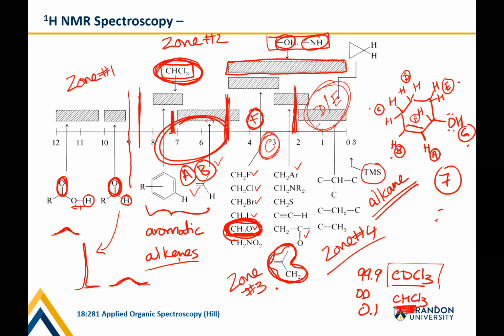So that's basically how I tend to tackle this, particularly if you know what you're making, right? I'm trying to make molecule A, and I started with molecules B and C. I know what the structure I'm looking for. Let's look for evidence of the protons in the various areas where they should be. So that's how we do this.